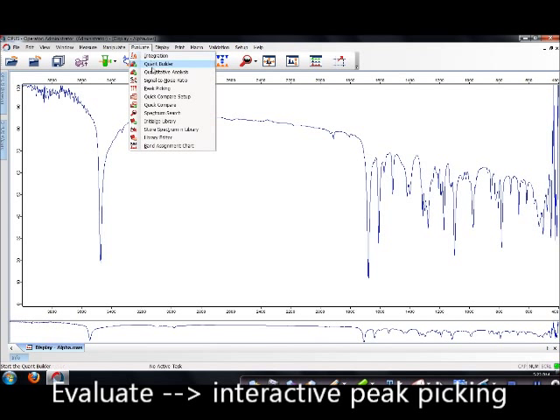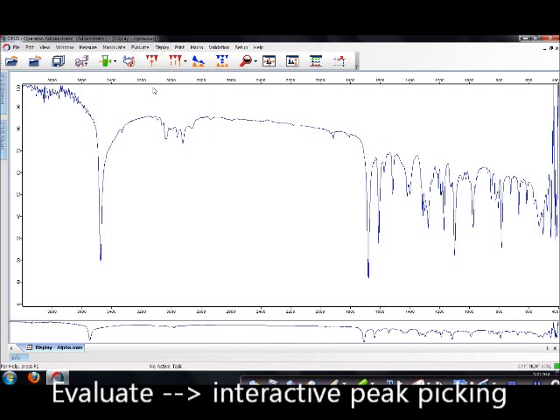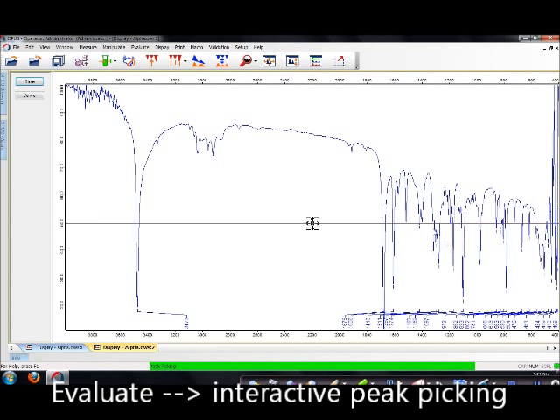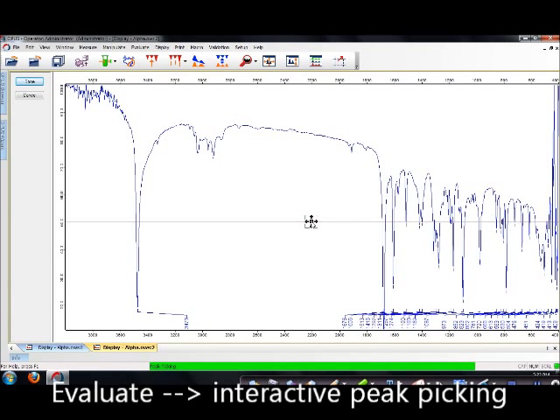So again, you can adjust the positioning of the spectrum that you want to view. And you can go on and do the same peak picking as what I have illustrated just now.